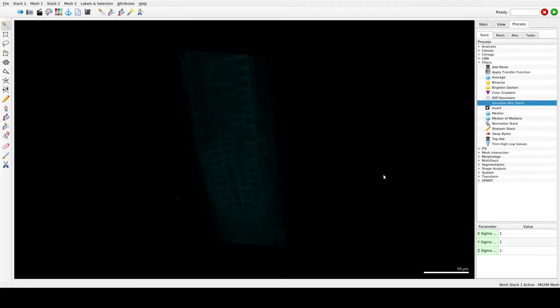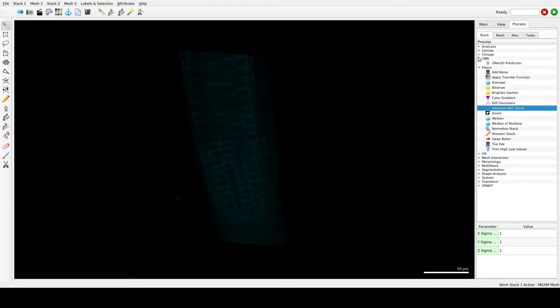Since 3D segmentation is quite difficult, MorphoGraphX uses a CNN add-on that can be used to process stacks and recognize structure using convolutional neural network deep learning tools, and this can greatly improve the segmentation results. Note that this add-on requires CUDA and it can be downloaded from morphographics.org/software. We can select CNN here.